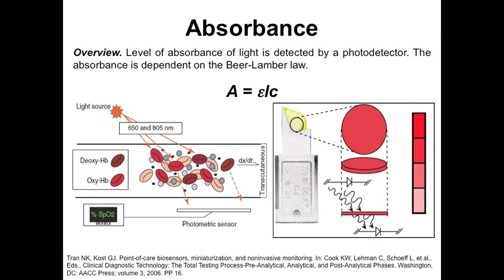Target-specific enzymes coupled to a chemical dye is illustrated on the lower right-hand corner. As the reaction proceeds, there is a color change relative to the concentration of the target found in the sample. The color intensity is measured by a photometric method wherein the difference in transmitted wavelength is calculated and interpreted.